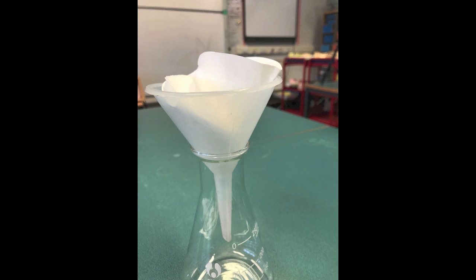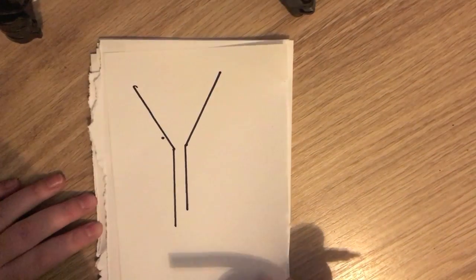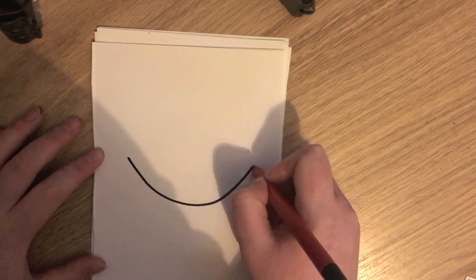Filter funnels and filter paper are used to separate solids from liquids. Evaporating dishes are used to heat water and evaporate it from a salt solution often.